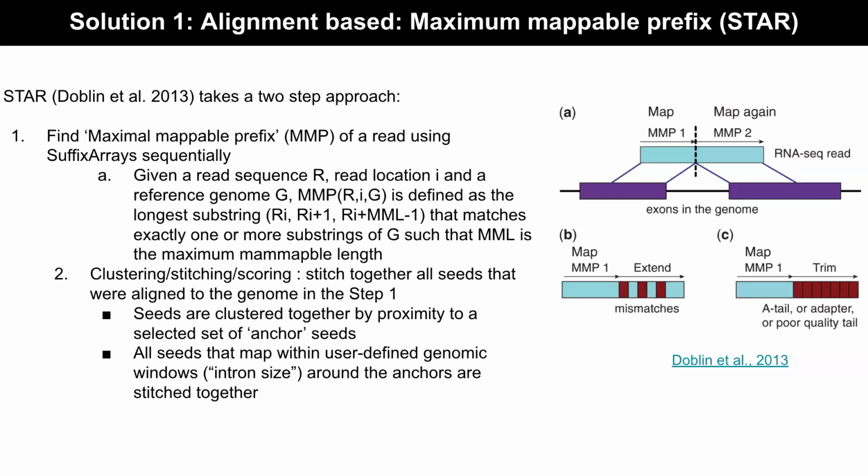I'll do RNA-seq on that kidney. I will do a de novo assembly. So I'll start to put this data together. And then I'll go and match it to the database that I have. How many of these isoforms am I characterizing in my data? For this, the data needs to be super good quality. You need to sequence a lot more because this is not a problem to assemble. And then you can figure out which isoform is new, which was not characterized previously. So it's just a matching problem, a set difference problem in that sense.